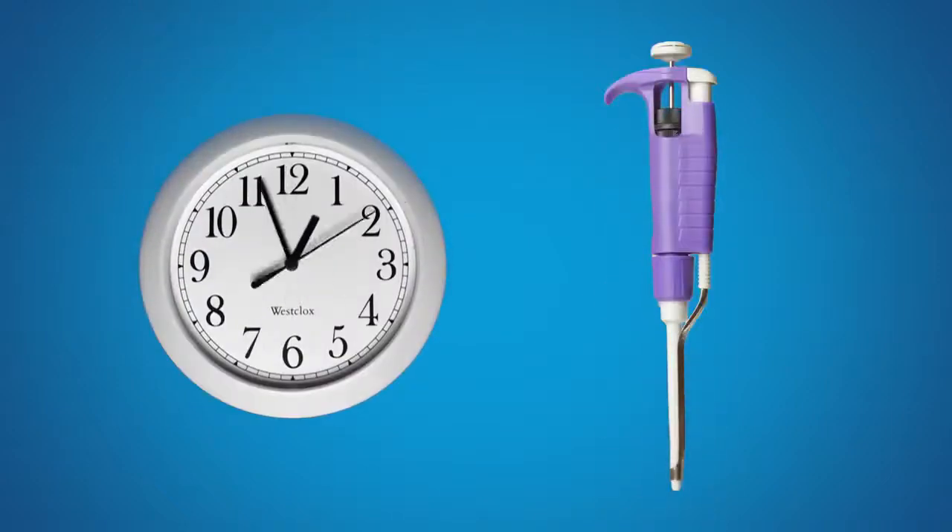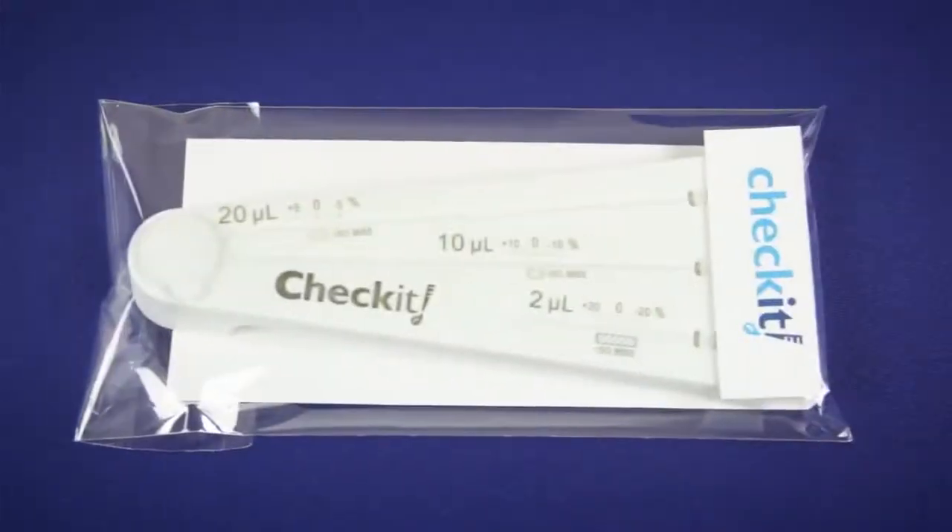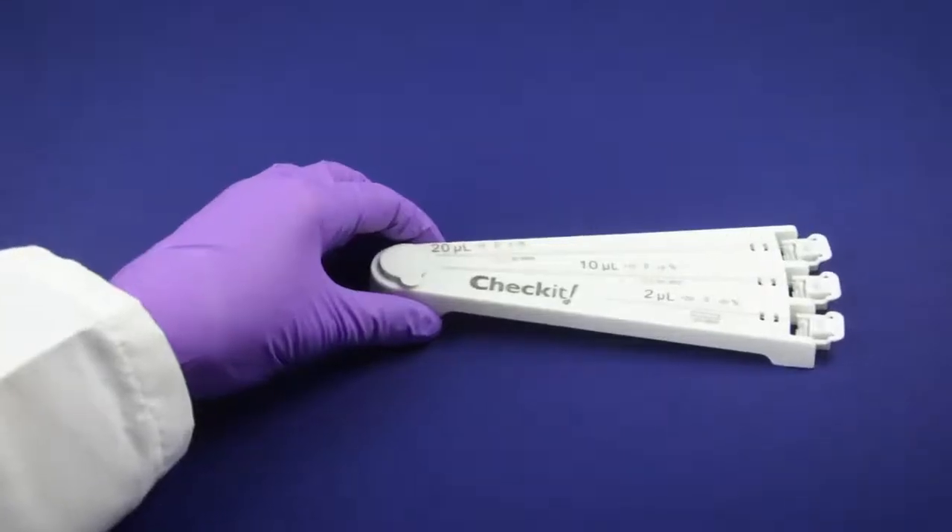Waiting for your pipette to be calibrated is like watching your cultures grow — boring! But if you don't check for accuracy, pipette errors could ruin your experiments. Say hello to the Check-It! The Check-It is a convenient new way to evaluate the accuracy of your pipettes in seconds.